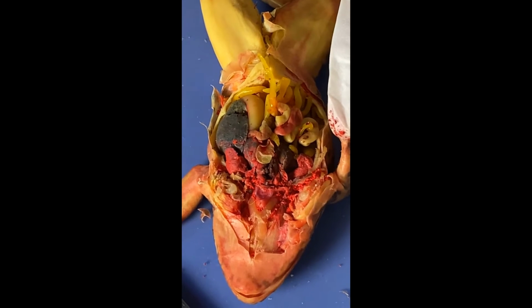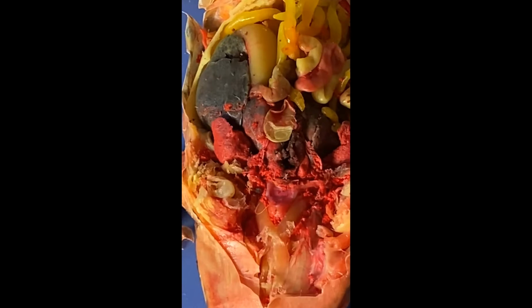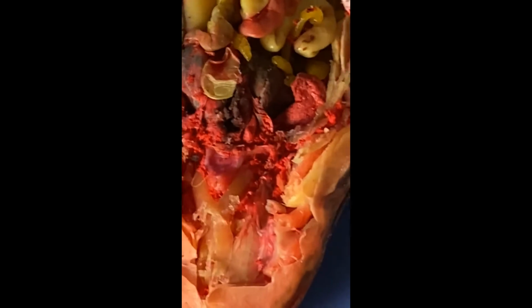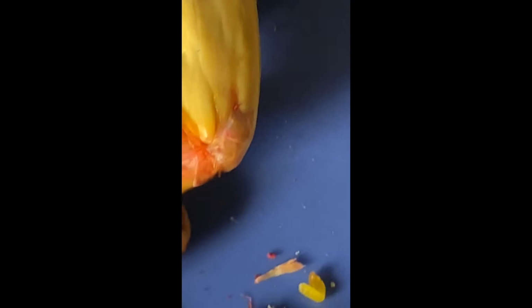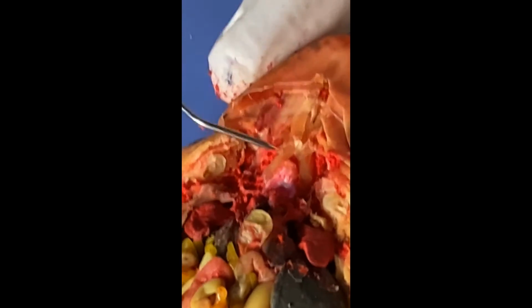Next, we're going to talk about the heart. Now, it's going to be a little hard to see because of all the dye, so I'm going to move it to my microscope. So over here, this pouchy structure over here, right above the lungs, is the heart. Let's try to get a better look at it.